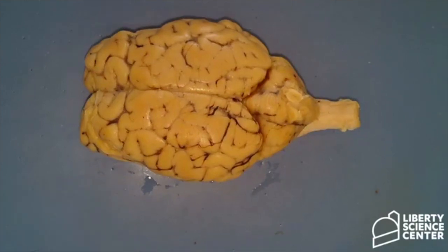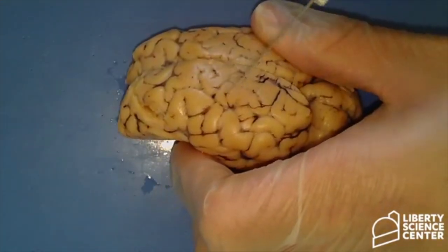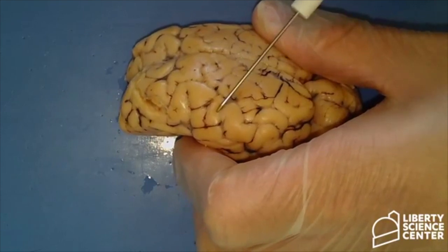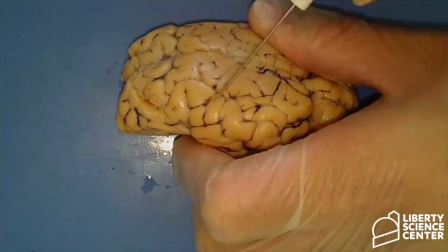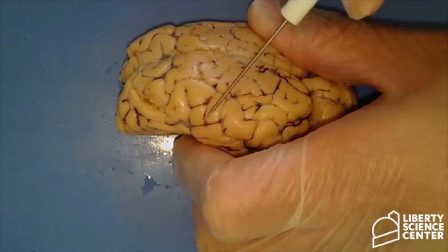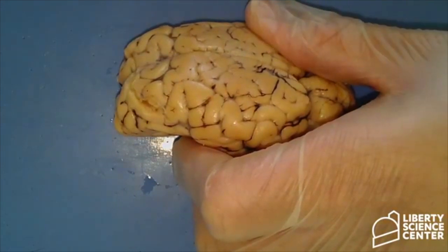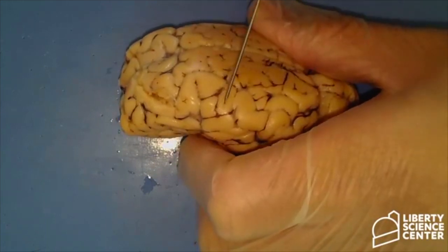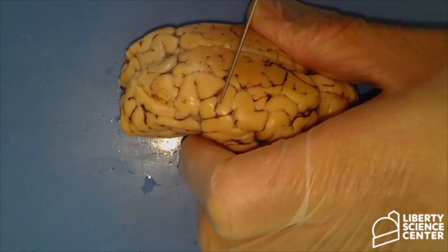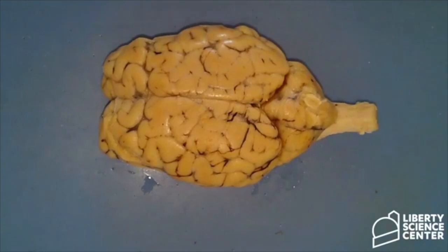So let's move forward. I mentioned all the deep grooves. When we talk about the grooves, we talk about these little ridges up here. I have it on my probe here. Those big hills and valleys, just for our intents and purposes, those little black lines are our valleys, and then we have those little hills. The little hills are called the gyrus. Those are the bulges that we see on the brain. Those little valleys, stained with preservative, we call the sulcus, which are all the dips into the brain. So when we make the incision, you'll see all those gyri and sulci.